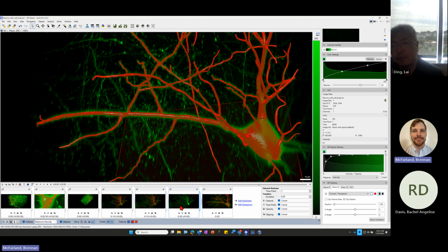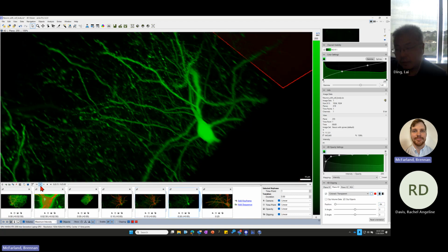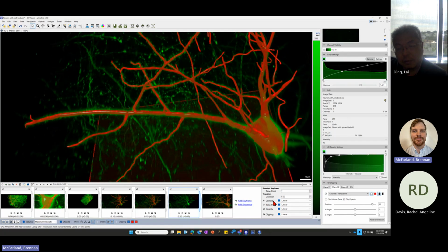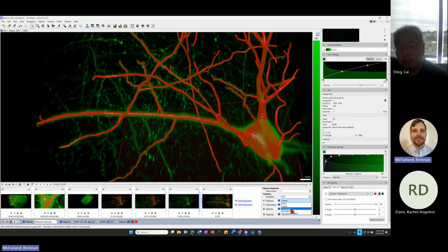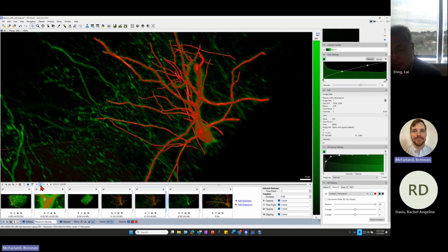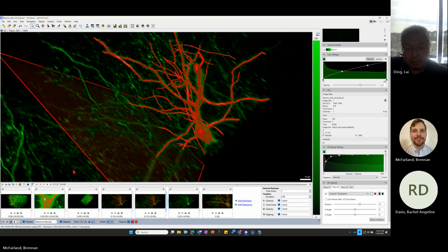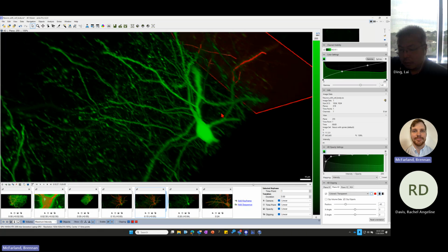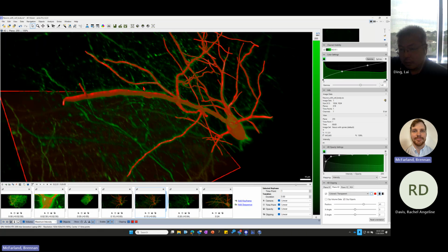And you'll notice that these transitions are pretty smooth, right? But we can choose to adjust this. Maybe we want to accelerate this part of it to move a little bit faster. It might be hard to see, but it's moving, and you can see in the beginning that it picks up a little bit faster.